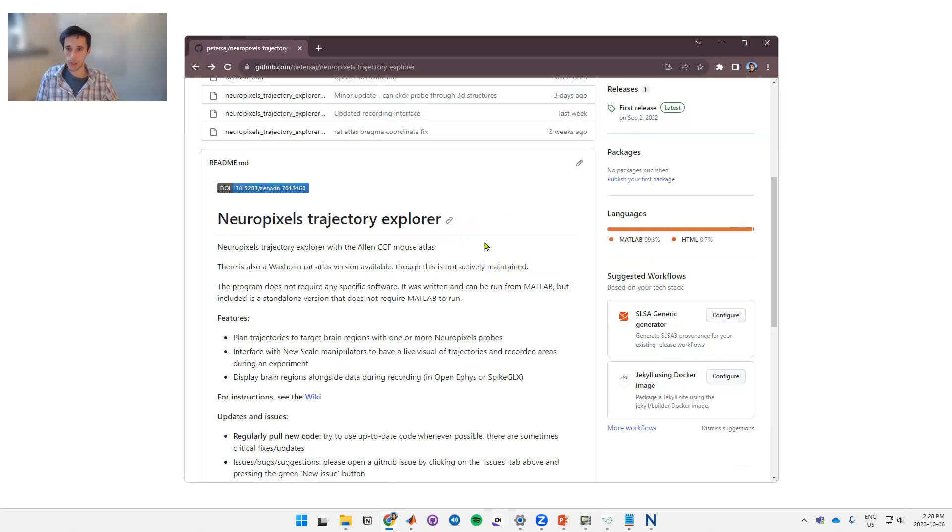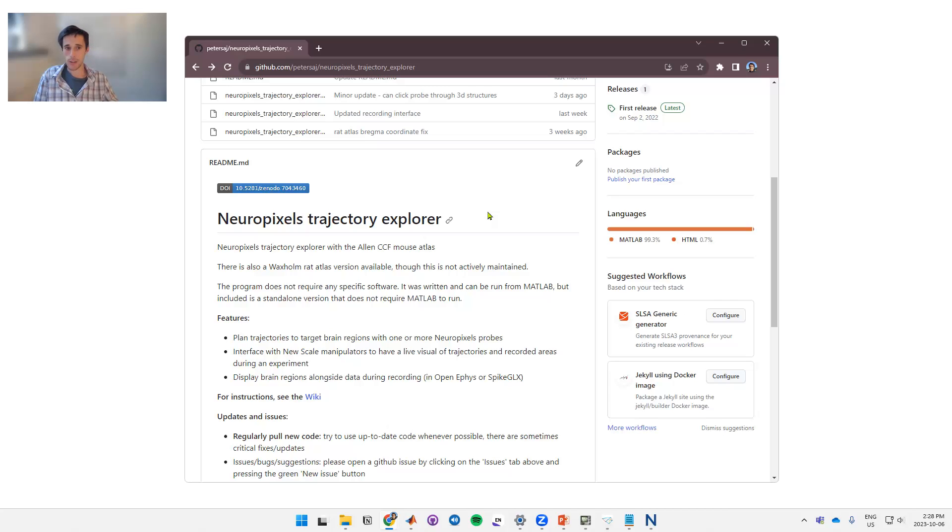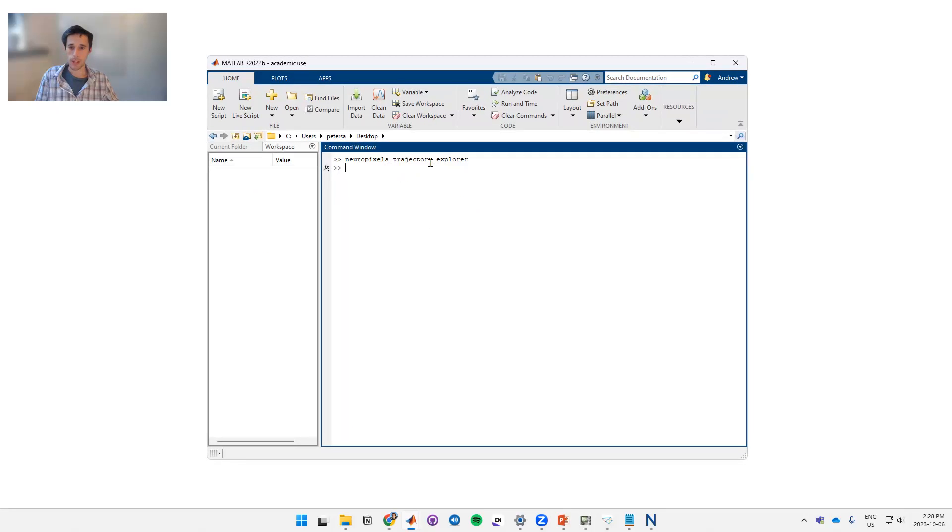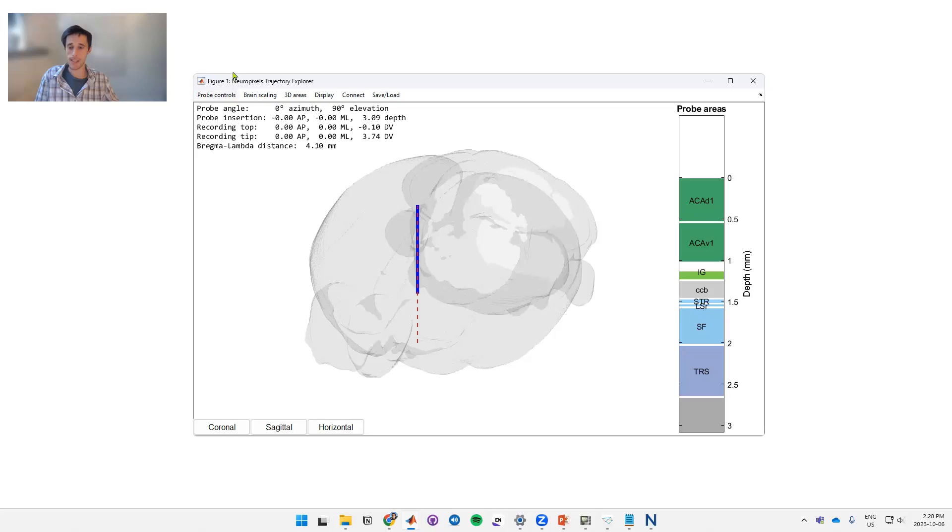There's two ways to launch this GUI. One is through MATLAB if you have access to that. The other is through standalone, so if you don't have MATLAB you run this as an exe and you can run it on any computer. If you run this through MATLAB, you do so by typing NeuroPixels Trajectory Explorer and then that pulls up the GUI which looks like this.